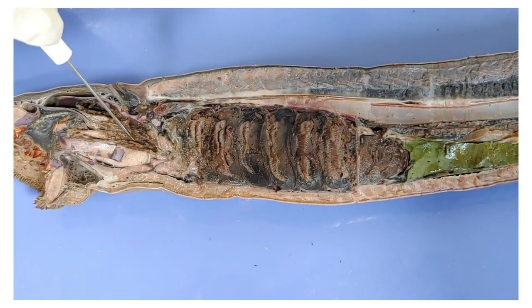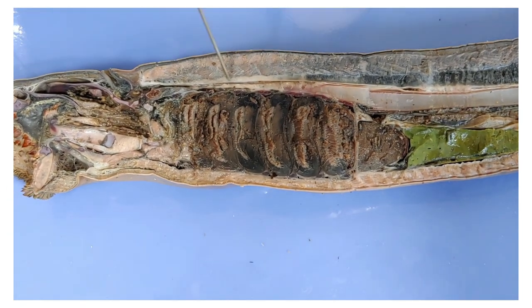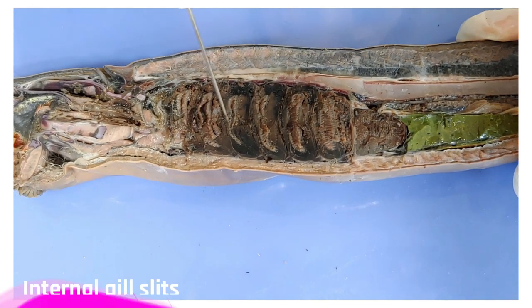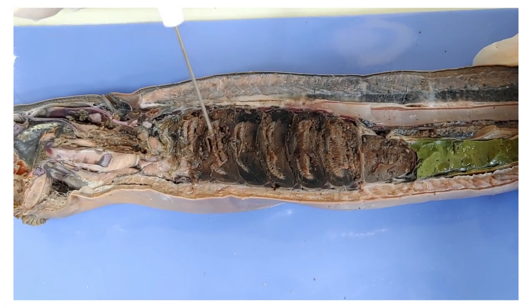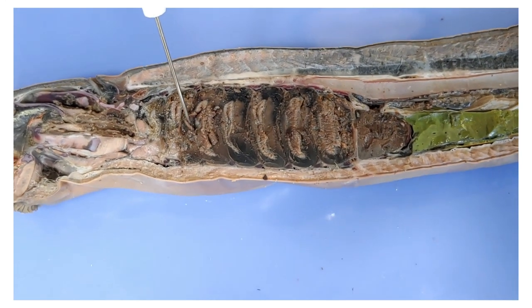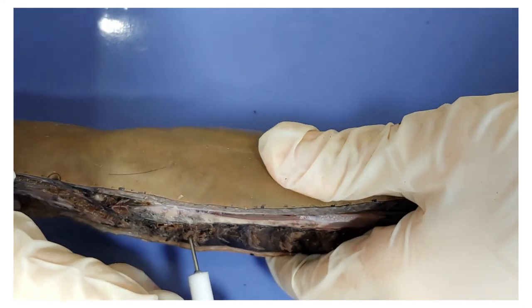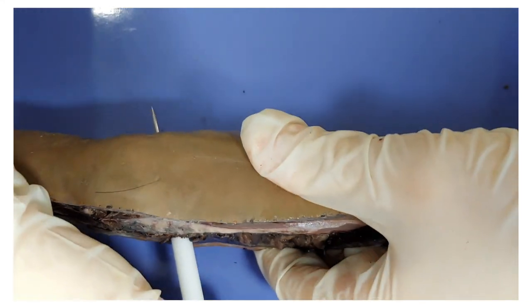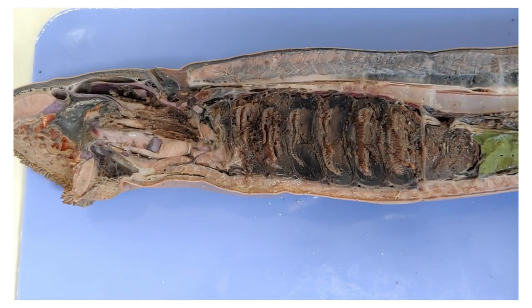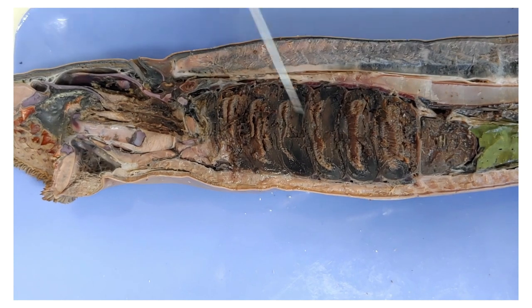Now we'll backtrack to the pharynx and follow the ventral branch. The ventral branch leads to the gills, which the lamprey uses to breathe. You can see they kind of look like stacked mushrooms. These holes here are the internal gill slits, and they're connected to the external gill slits we saw earlier. The lamprey takes in water through its mouth, which travels to the ventral branch of the pharynx, goes through gas exchange in the gills, and leaves through the gill slits.